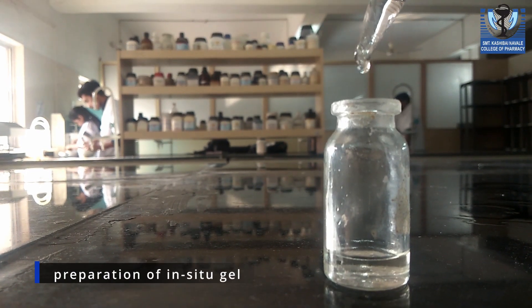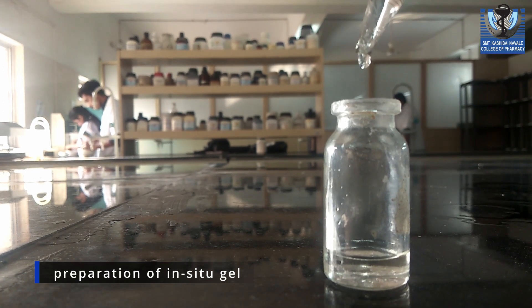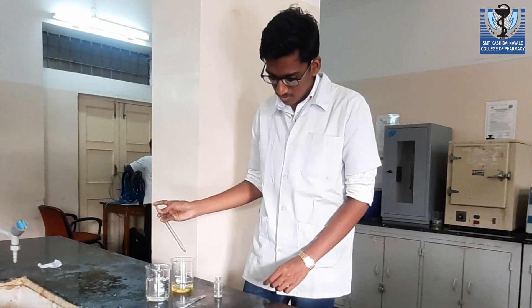In situ gel is prepared by addition of polymers in water, and then the niasomal suspension is added to it for the final preparation.